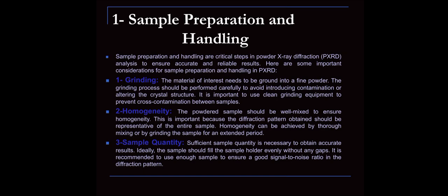First one, grinding. The material of interest needs to be ground into a fine powder. The grinding process should be performed carefully to avoid introducing contamination or altering the crystal structure. It is important to use clean grinding equipment to prevent cross contamination between samples.